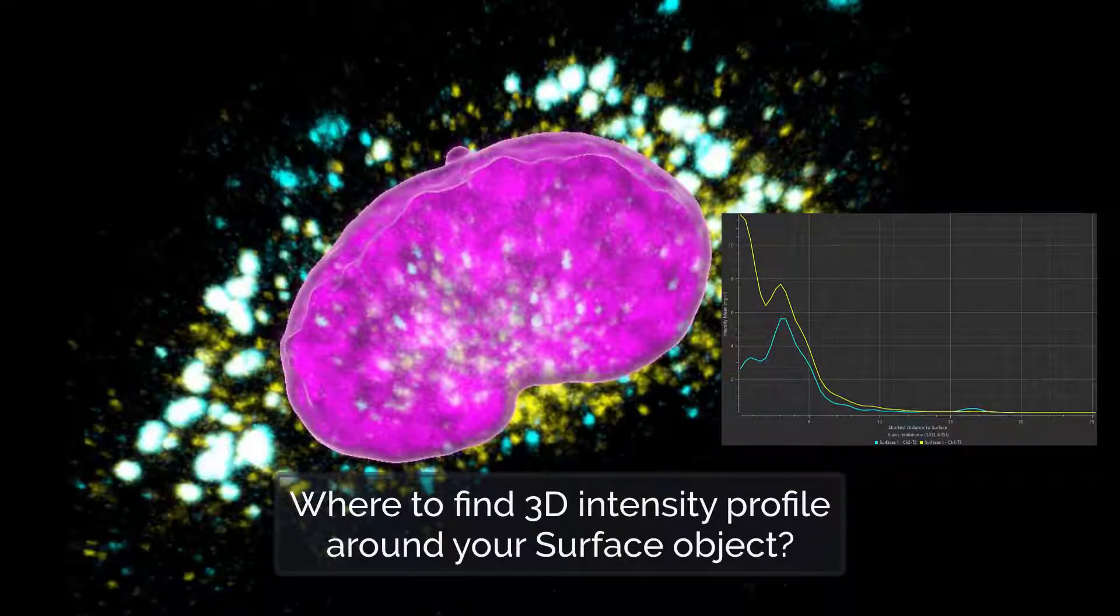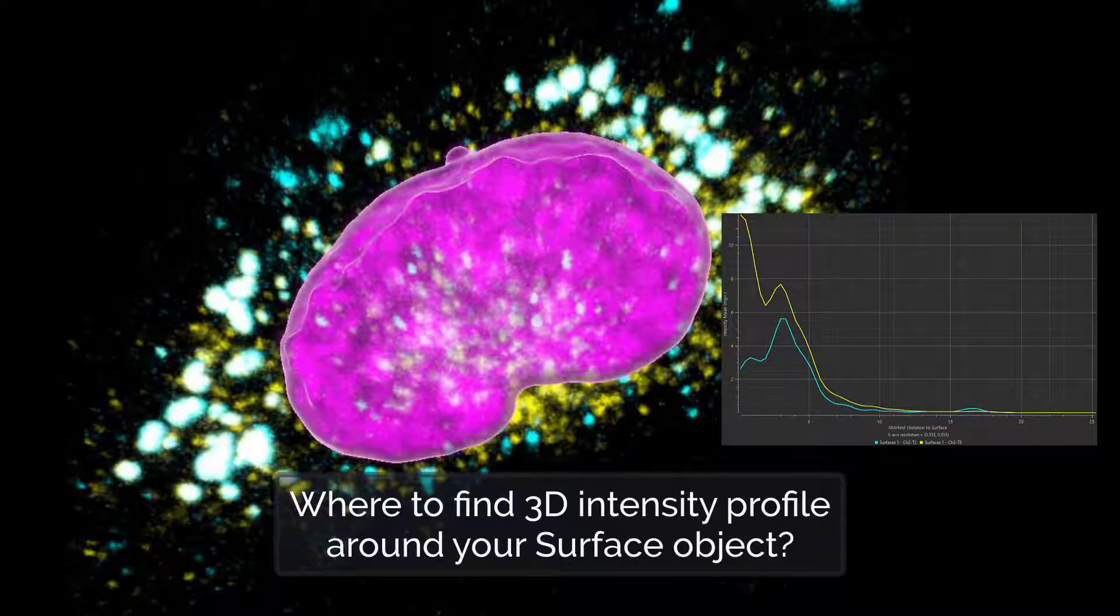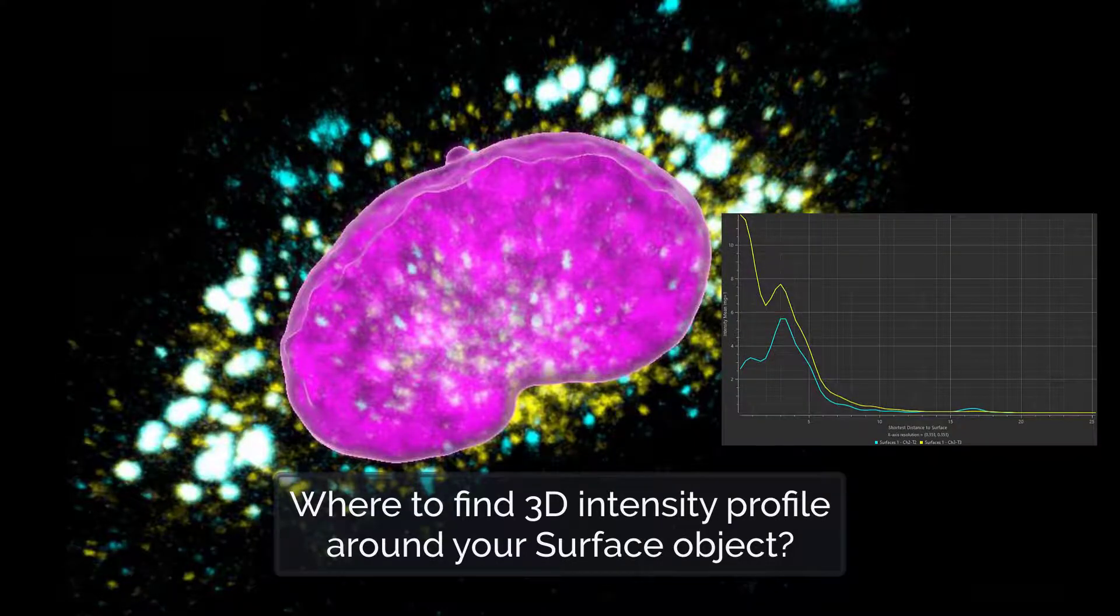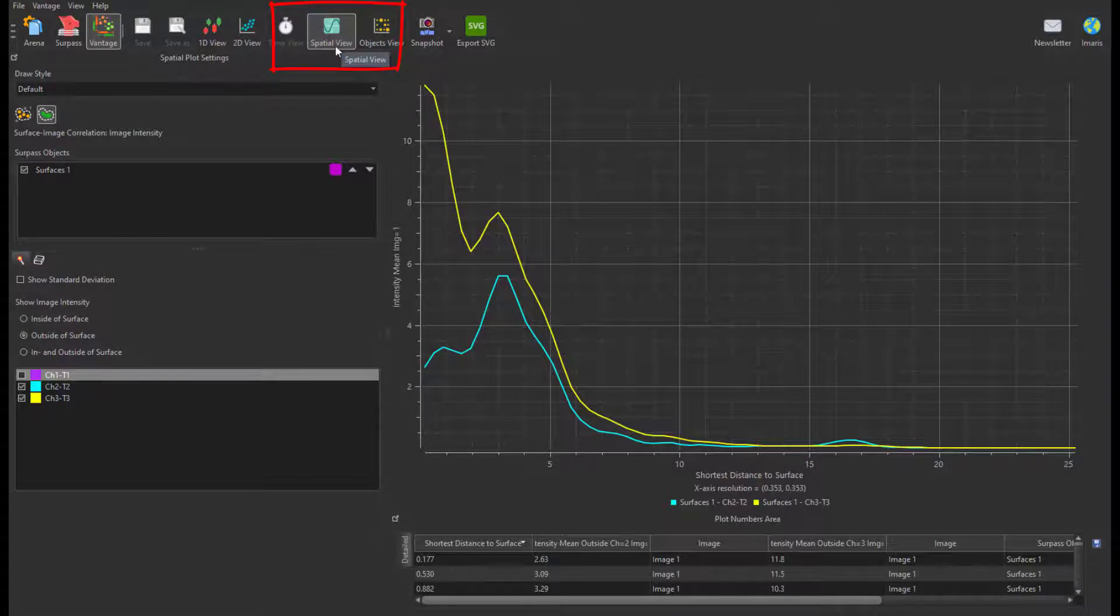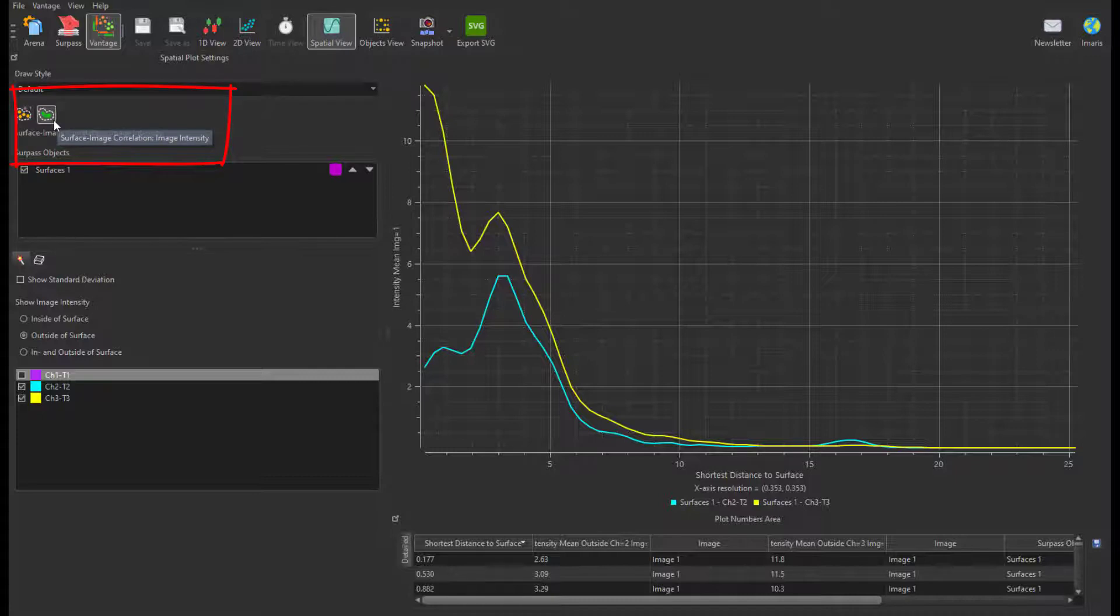In this tutorial, you will learn where to find a 3D intensity profile around your surface. Inside the spatial view in Vantage, you can find a useful plot called Surface Image Correlation.